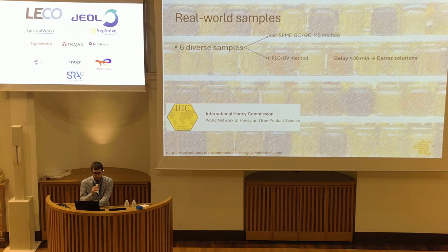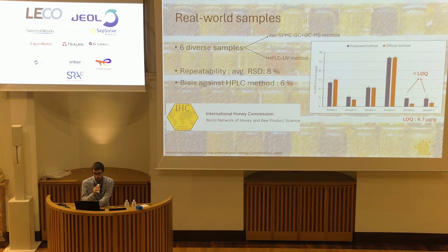One important thing here is that since HMF is not really stable in aqueous solution, if there is a delay of more than 30 minutes between the sample preparation and the injection, we have to add a keeper solution, here Carrez solution. To avoid adding this, we managed to do everything below 30 minutes.